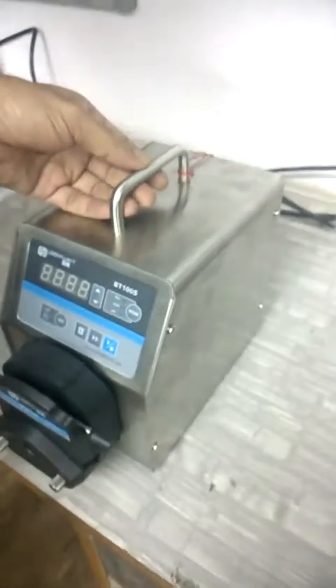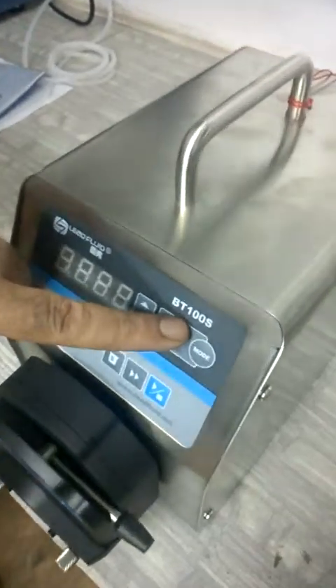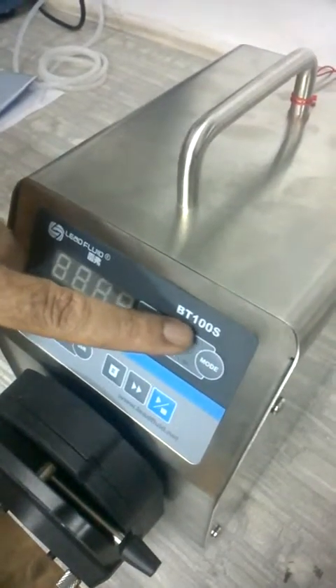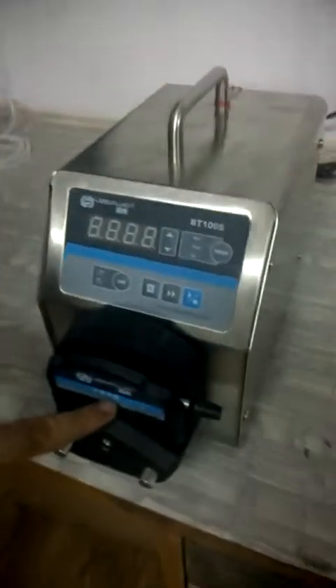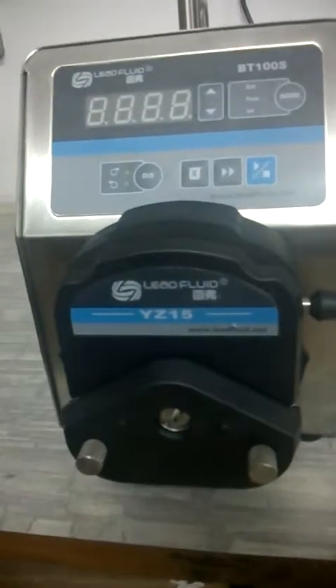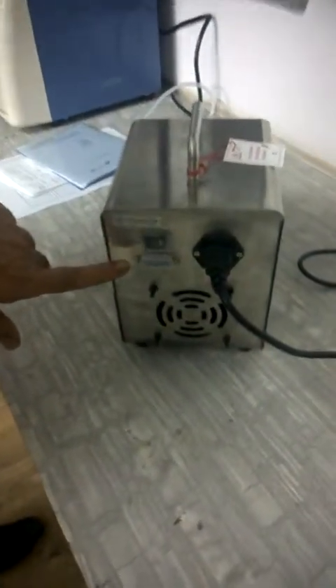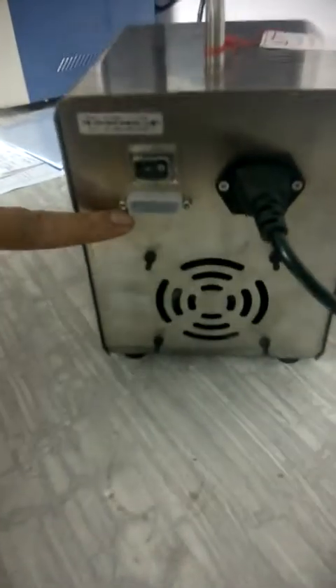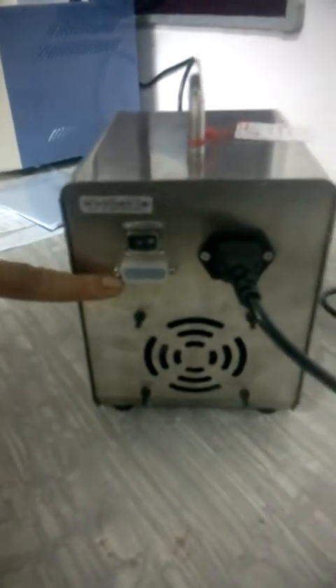This is a 230-volt machine and this pump is the BT100S. This is a BT series pump and this head is YZ15. This machine also features an RS485 Modbus controller if you want to control the pump from some external source.